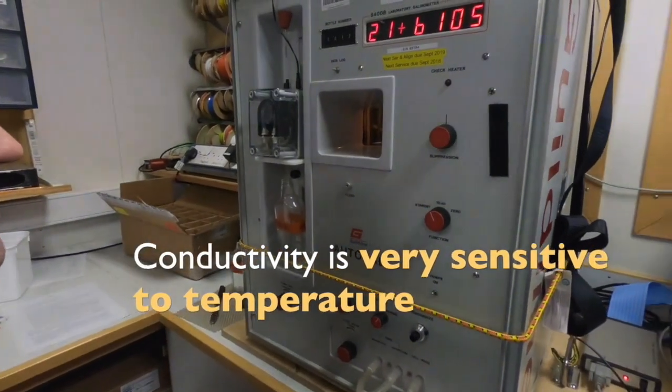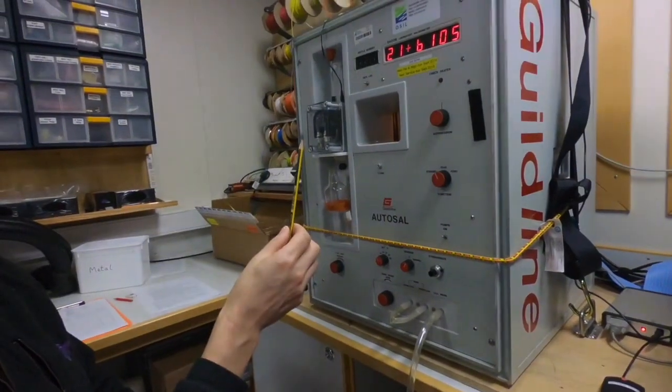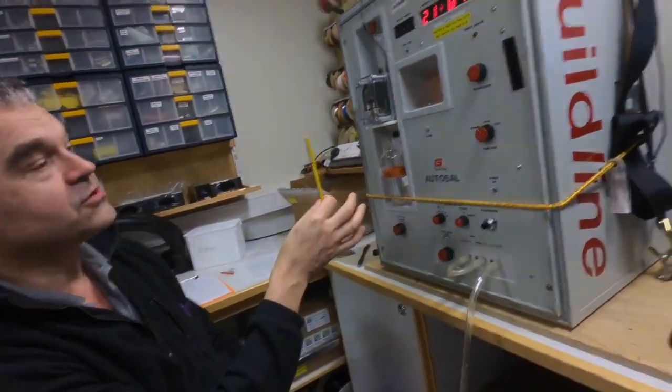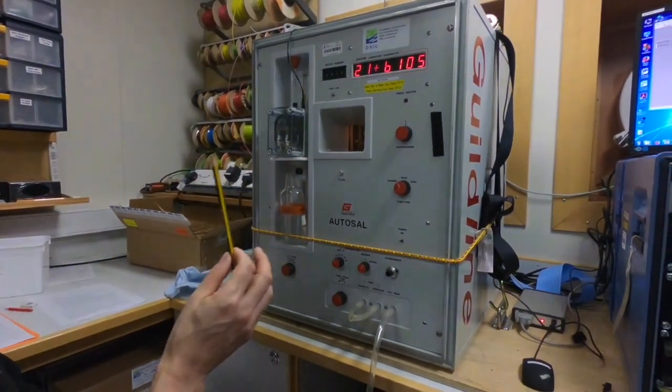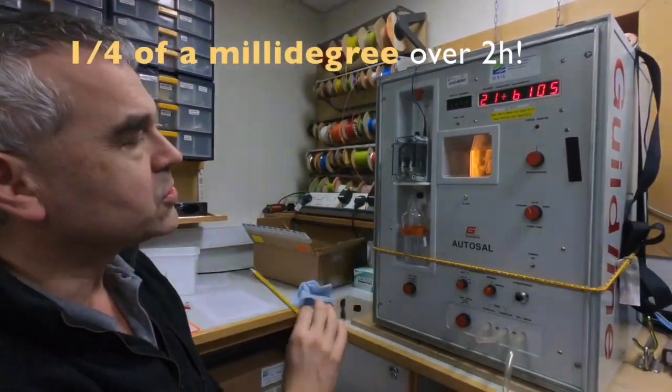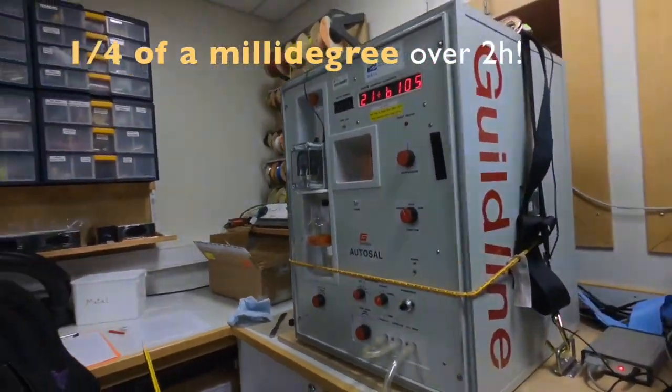The water in the cell is of a very precisely controlled temperature. They flash on to warm the bath a bit and then they flash off to allow the bath to be cooled, and that means that the temperature is being maintained to within about a quarter of a millidegree over a two hour period.